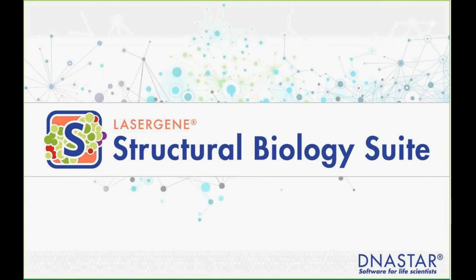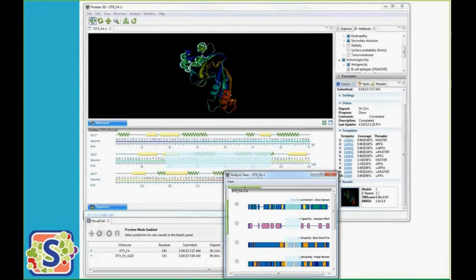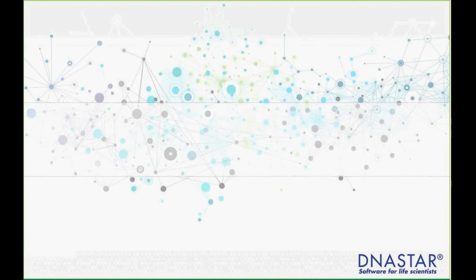We call this our structural biology suite. And again, we have other webinars that focus on these areas, but we've done a lot of development lately in structural biology, and that includes a very nice interface for looking at 3D structures and predicting structures of proteins. So again, it's a comprehensive suite of tools, and we have fully functional demos for all these different tools. And we have a full set of webinars and videos that cover these in detail. So we're going to focus on the genomics suite today.